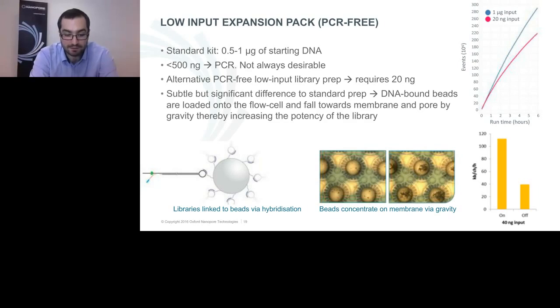If you wanted to do assembly, it's within range of the MinION as well. You can get good coverage and do genomic assembly. I'm not sure if that necessarily answers your questions. I hope so.